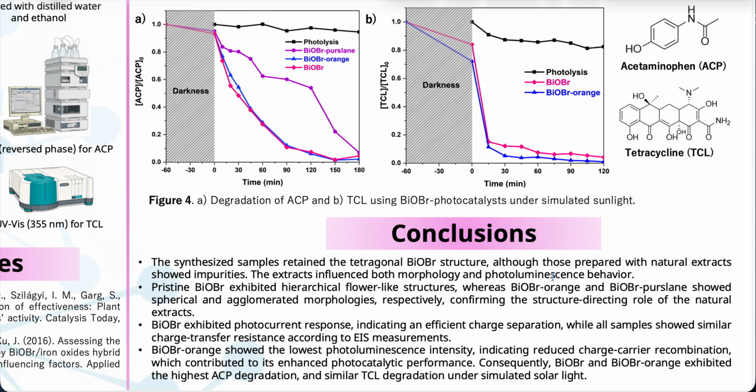Among the synthesized materials, bismuth oxybromide orange showed particularly promising properties, including lower photoluminescence intensity and enhanced photocatalytic performance toward acetaminophen.